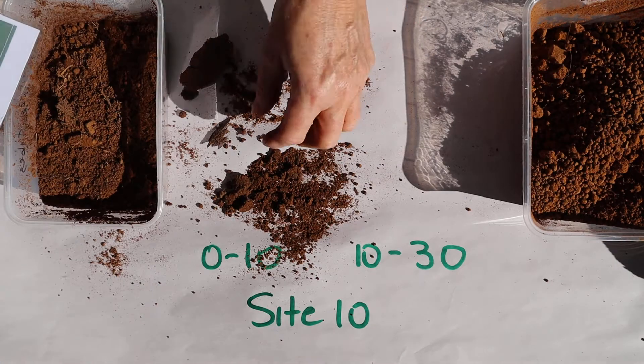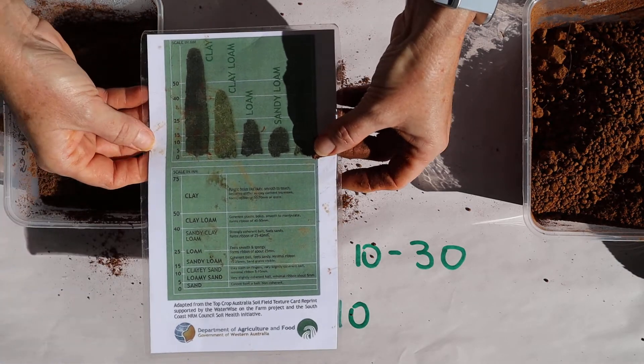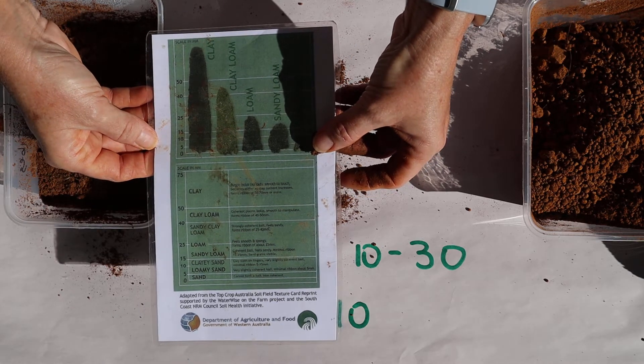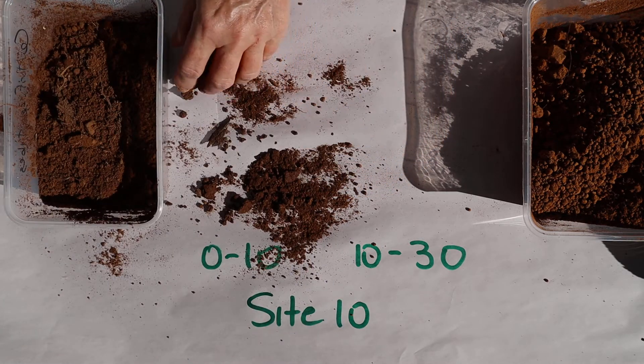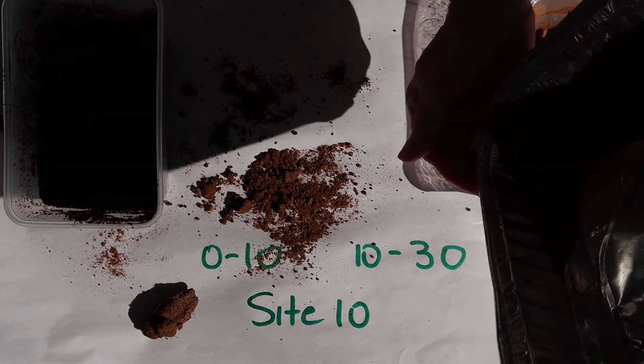I would call this a loamy sand, definitely. Now we'll do the 10 to 30 centimeter layer.